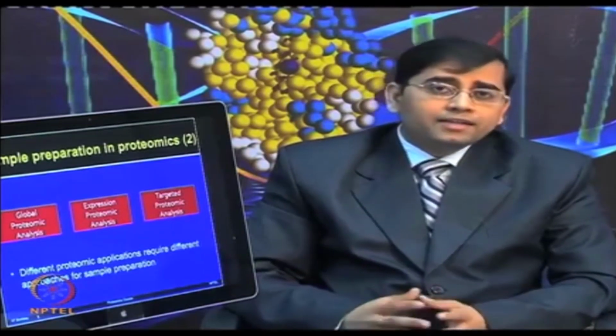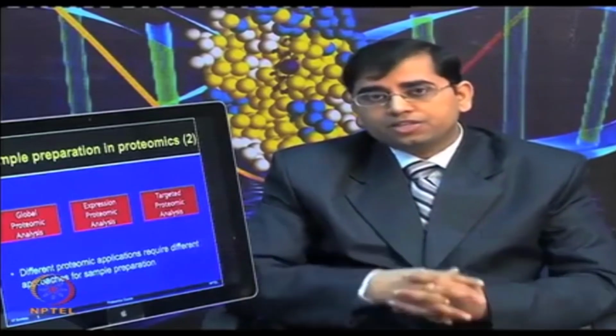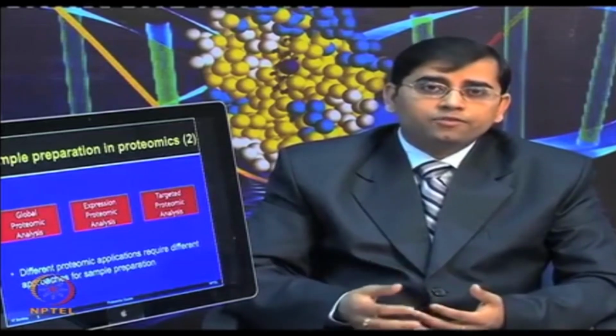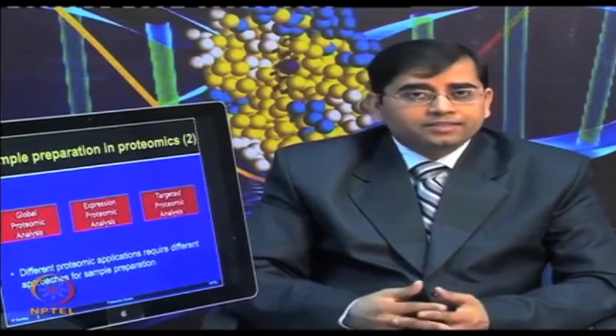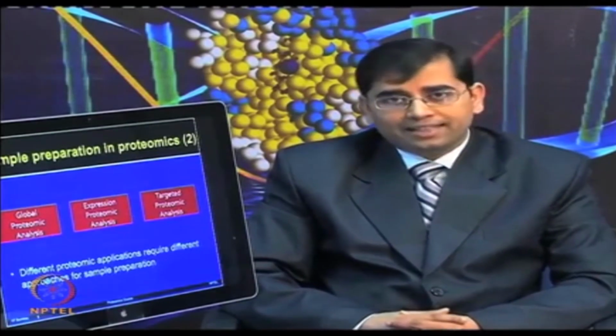Now, when you are looking at targeted proteome analysis, you just want to pre-fractionate your sample in such a way that only that particular component is isolated and then all the proteins from that organelle or cell are extracted. So, different types of strategies need to be used to perform these types of proteomic analysis.